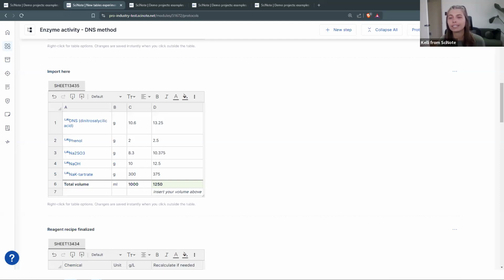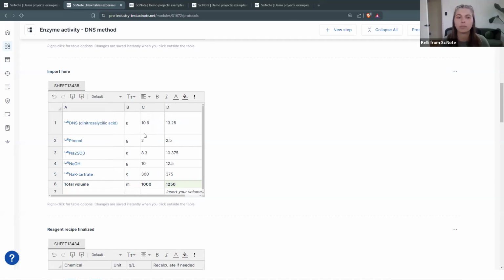So let's break this down a little bit here. You want to manually extend the length and width of the table. I guess I have some questions that go along with this. Are you extending the length of the columns like I showed in my use case? I can show that here. So are you extending your columns there?